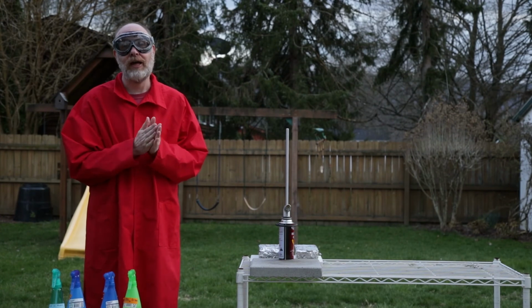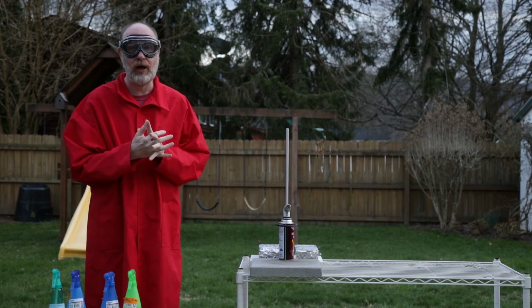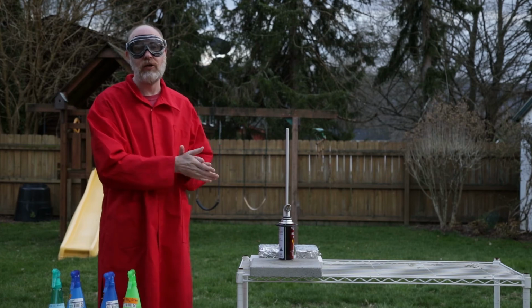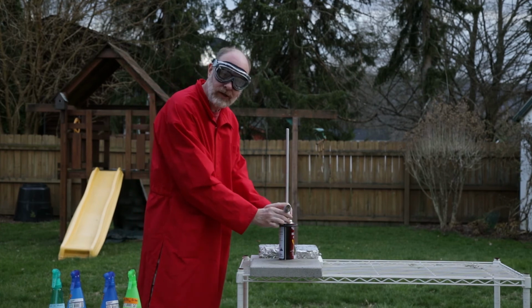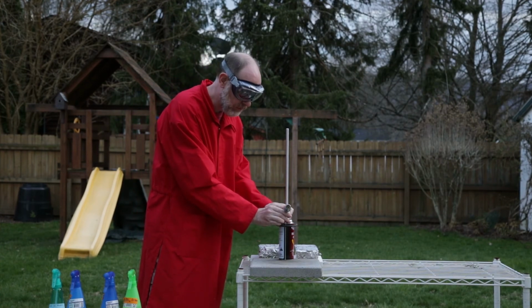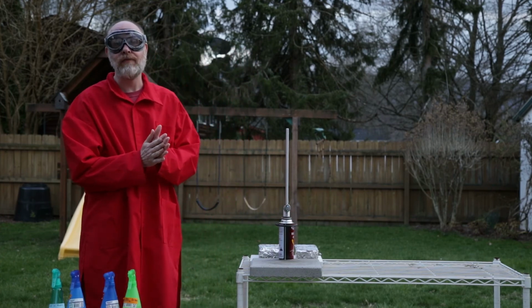All right, so the sun's gone down a little bit. Time for us to go ahead and do the actual experiment where we can see this atomic emission from these metal ions as we inject those or spray them into a flame. And we're going to start with a nice blue lean flame that we talked about. So complete combustion, very, very hot. We certainly want to be very careful to make sure that we stay away from the flame.